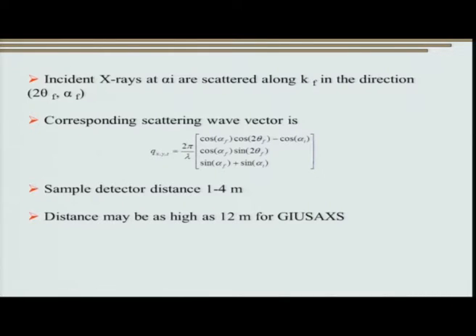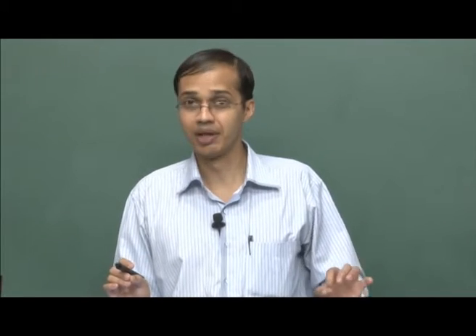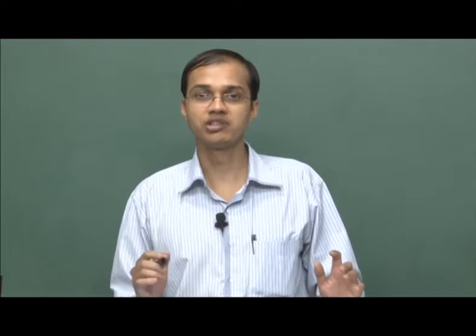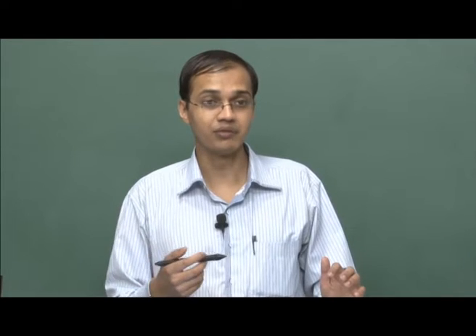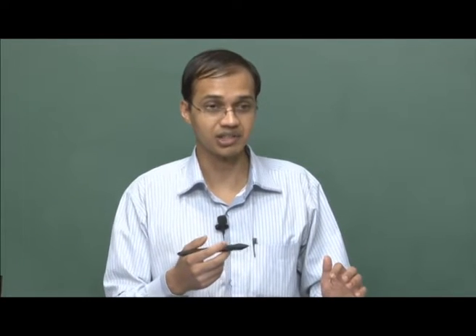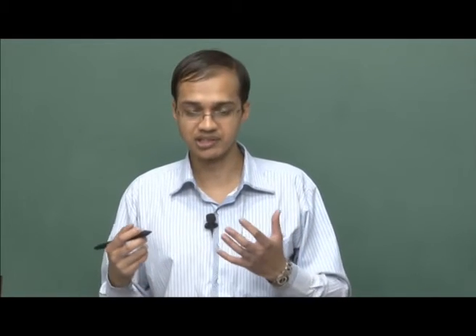Okay, so let us now touch upon the physics of grazing incidence small angle X-ray scattering. It is a pretty involved subject, and I am not going to touch upon all the details of the scattering or diffraction theory associated with it. But what we are going to try and do is get a feel for things, and see how the knowledge we gained while deriving the structure factor for normal diffraction, as well as the form factors in the last class, can be extended to understand how grazing incidence small angle X-ray scattering works.